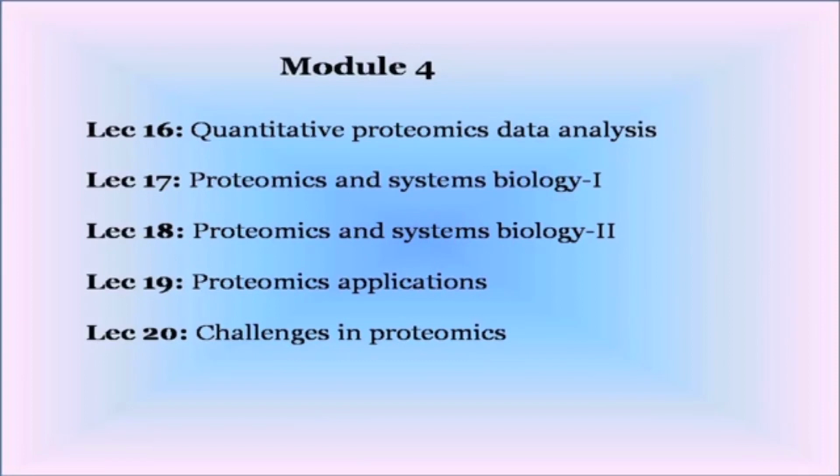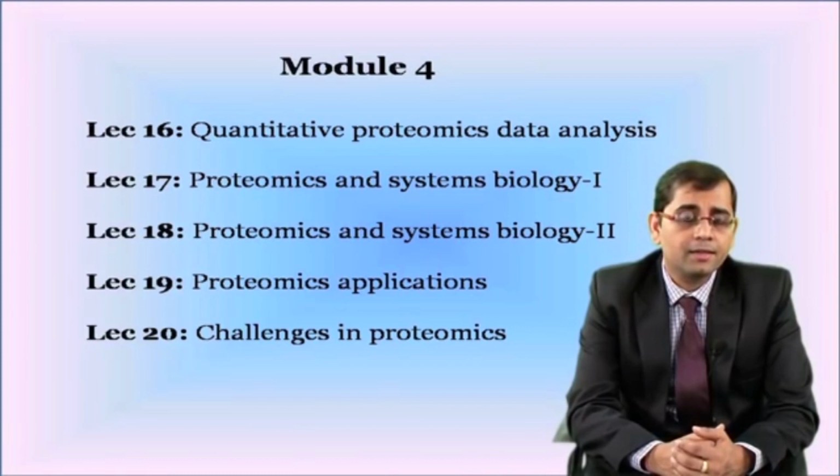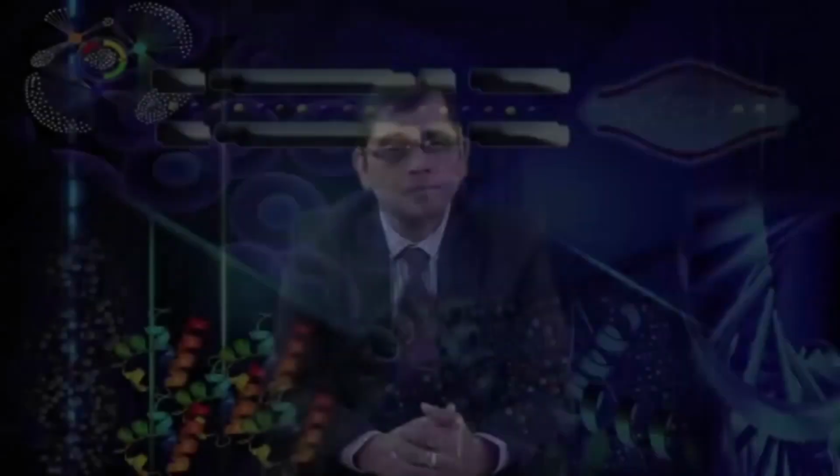In the last module, we'll talk about quantitative proteomic data analysis and some aspects of systems biology applications. The quantitative proteomic technologies aim to identify the differentially expressed proteins in a biological sample. The differential expression of proteins can be caused by a disease state or various external factors like stress, drugs, or different experimental conditions.